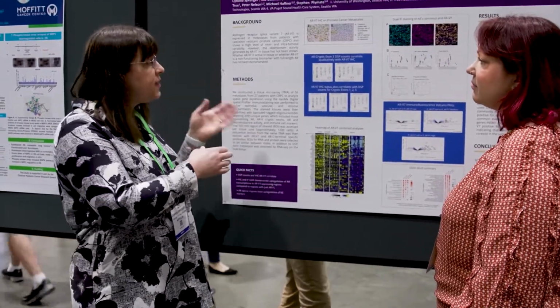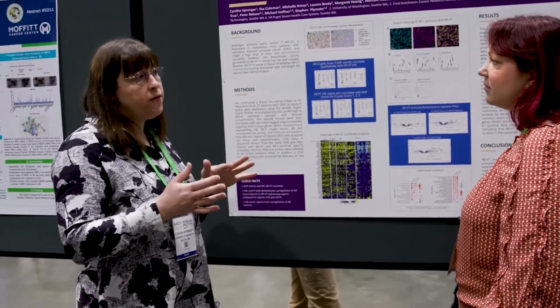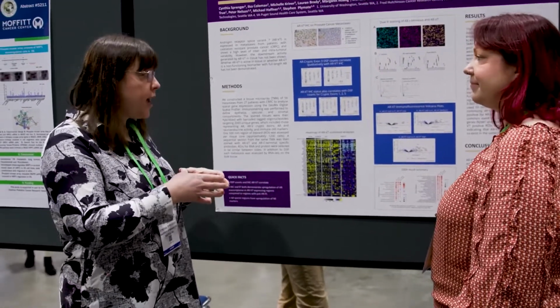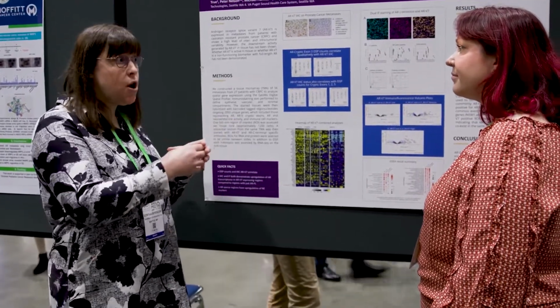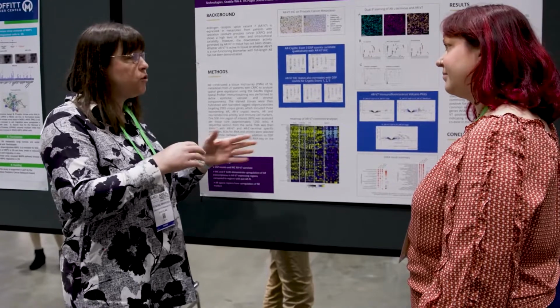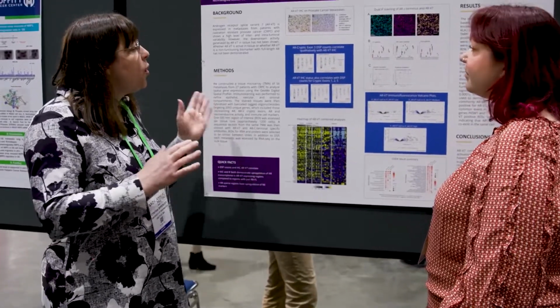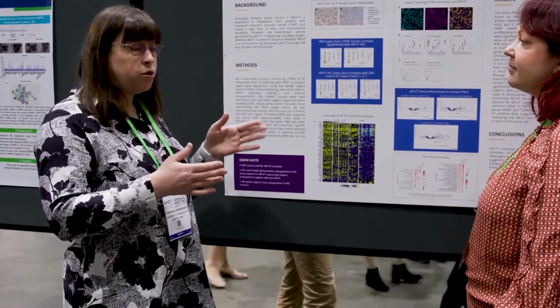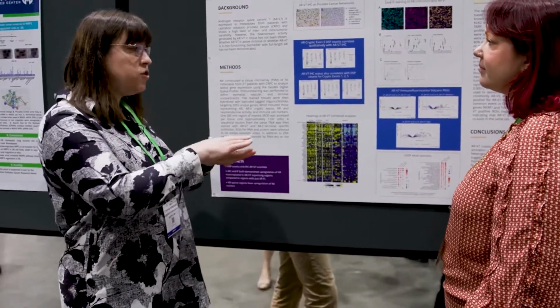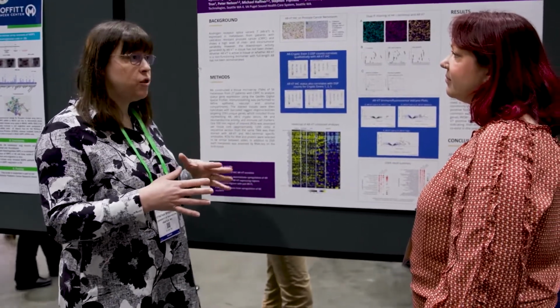So within those metastases, we picked different regions of interest that have about 1,200 cells per region to look at. So this isn't single cell profiling, but it definitely is narrowed down to regions, which is great because it'll show us the diversity within the tumors. And this study was initially started by Dr. Pete Nelson and Dr. Lauren Brady, and they published that general overview of what the differences are in these tumors in Nature Communications.